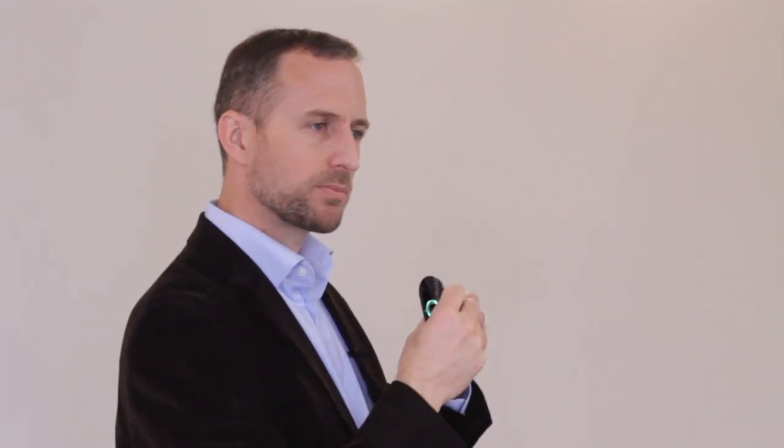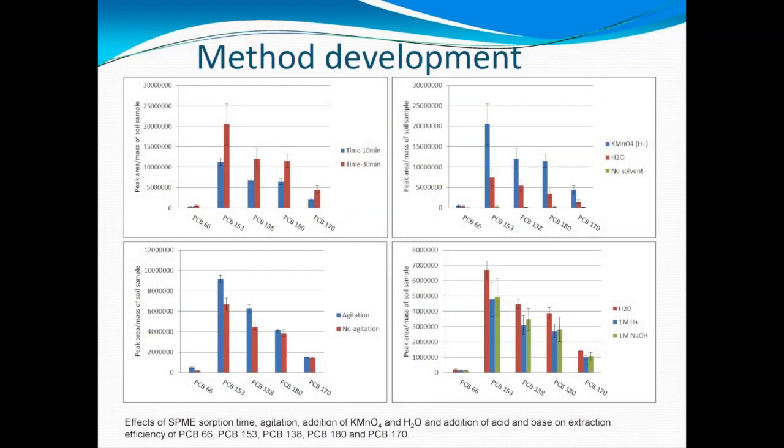Now, a lot of the work we've done is in trying to establish the best conditions in the extraction process and in the separation process and the detection process, to see how best to analyze, to get the best limits of detection for these PCBs. Here's a highlight of some of the things we've optimized.